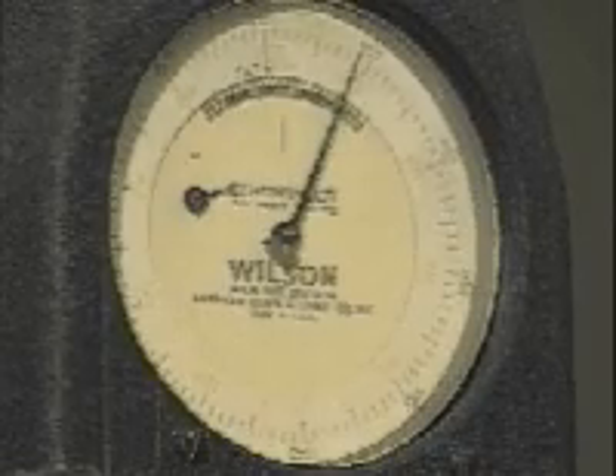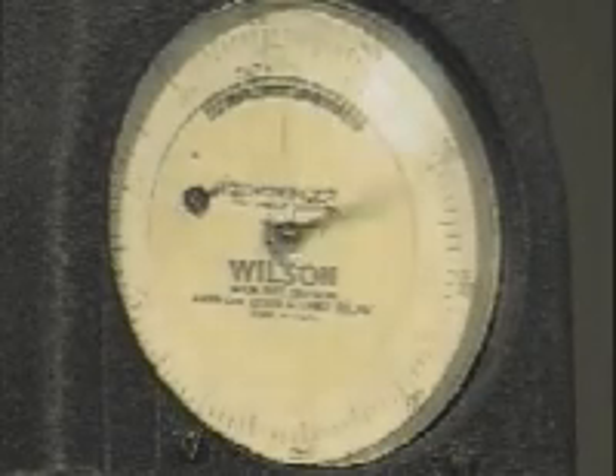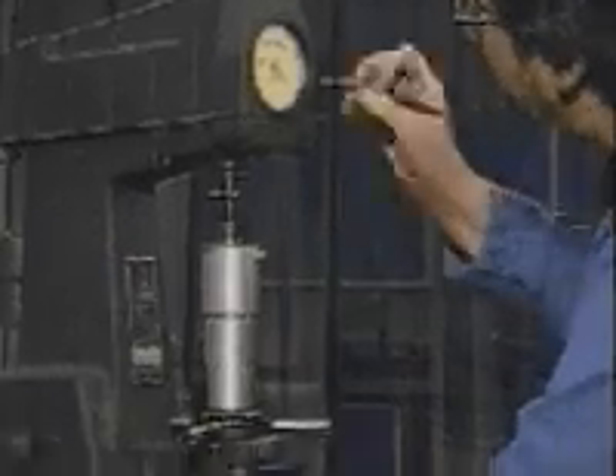The dial pointer turns in a counterclockwise direction. When the major load application stops, return the release lever to the start position. Read the hardness value from the indicator dial and record it.